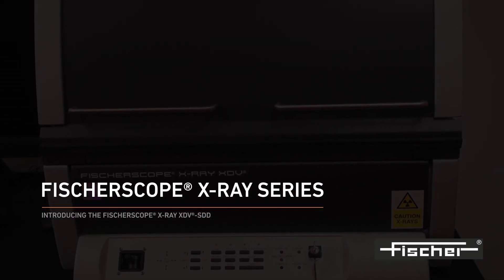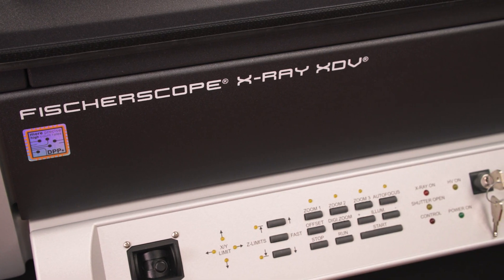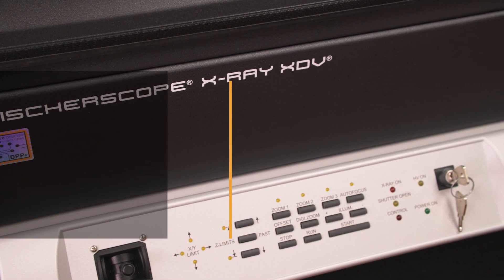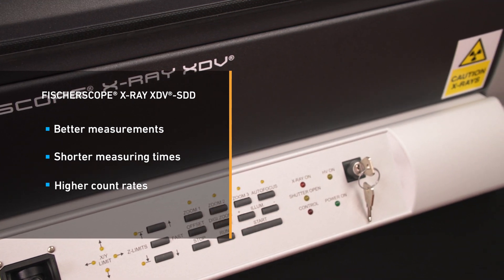Introducing the FischerScope X-Ray XDV-SDD — a premium, universal instrument for measurement of nanometer range coatings and ppm-level material analysis.